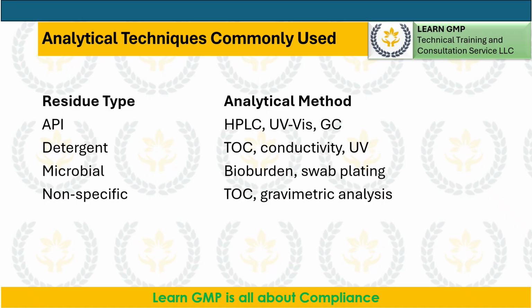Analytical techniques commonly used. For API: HPLC, UV-Vis, or GC. For detection of detergent: TOC, conductivity, and UV. For microbial: bioburden and swab plating. And for nonspecific testing: TOC and gravimetric analysis.